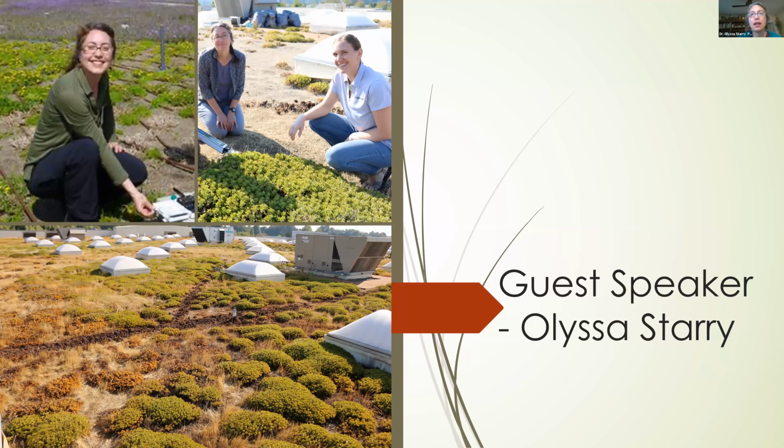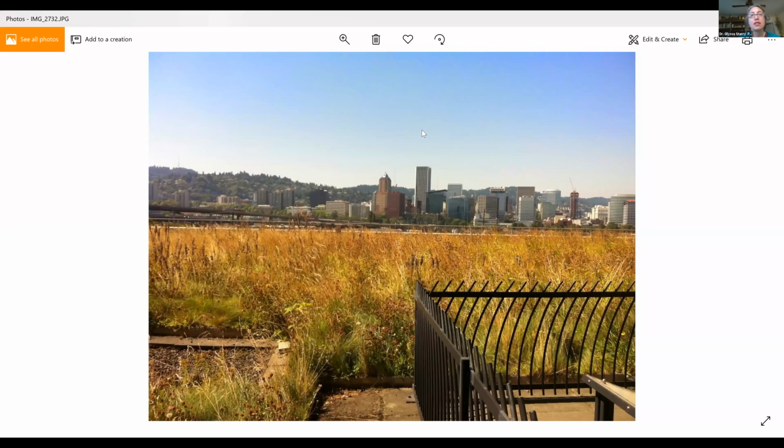This is the East Multnomah County Courthouse building. Anyone can visit this roof, and it has a great view of Portland. I highly recommend it. Anyway, there are two main areas that I would use the CI-340 for. One is to study the green roof water balance.